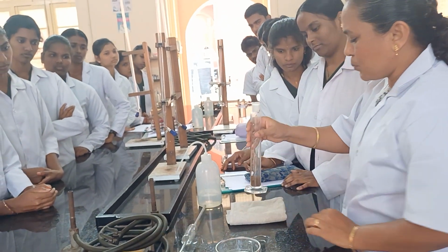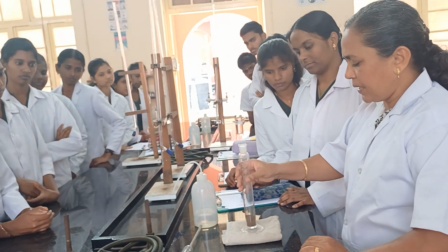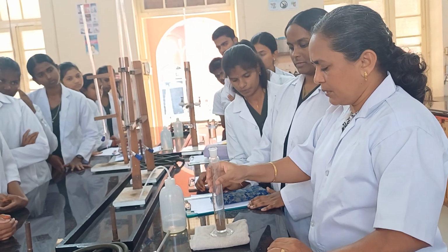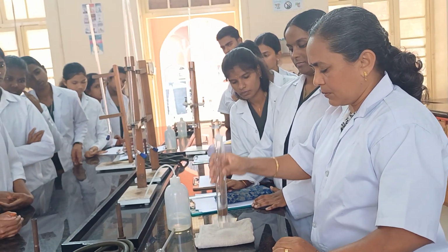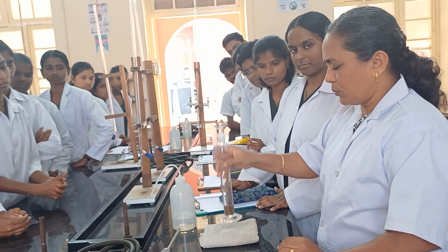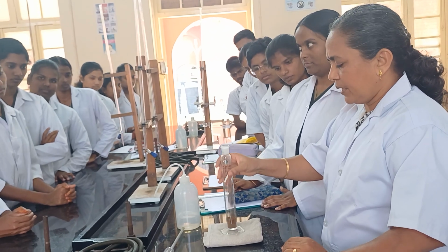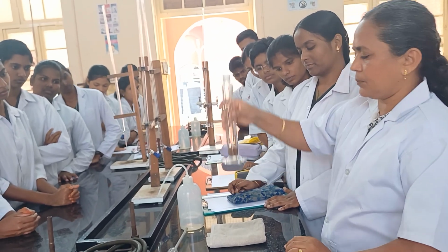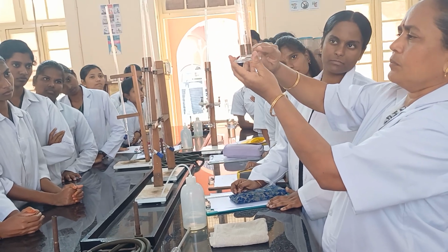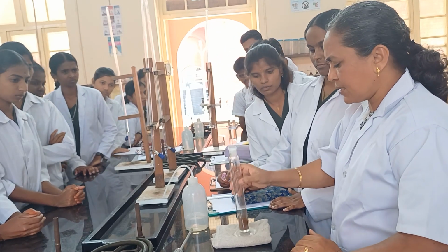Transfer the soil in small quantities at a time with gentle tapping. After completely transferring the soil, note down the volume of the soil. Weight of the soil is 20 gram. Then we note down the volume of the soil, that is V1. Weight W is 20 gram, V1 is 17 ml. So the volume of the soil is 17 ml.